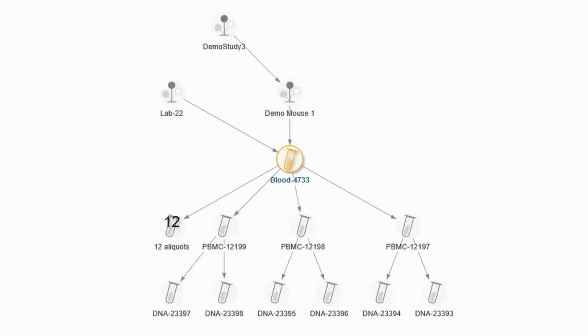In LabKey LIMS Suite, you can track the lineage of your samples, from the source of where your samples originate, such as a patient or study, to their child samples, such as aliquots or derivatives.